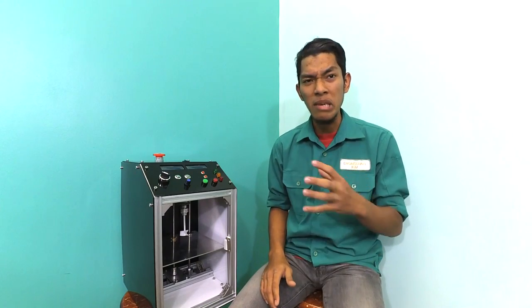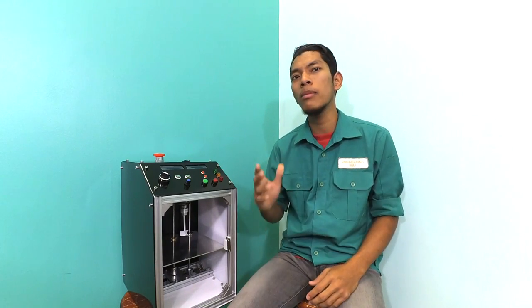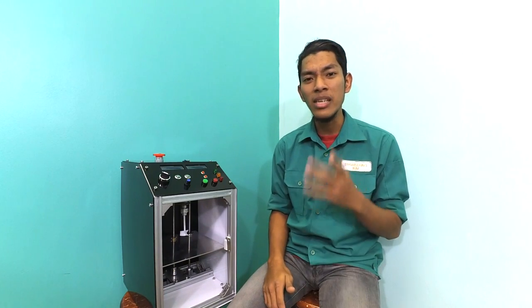From the very beginning, the stirrer machine is designed to be very powerful, very capable, but also remarkably simple to use.